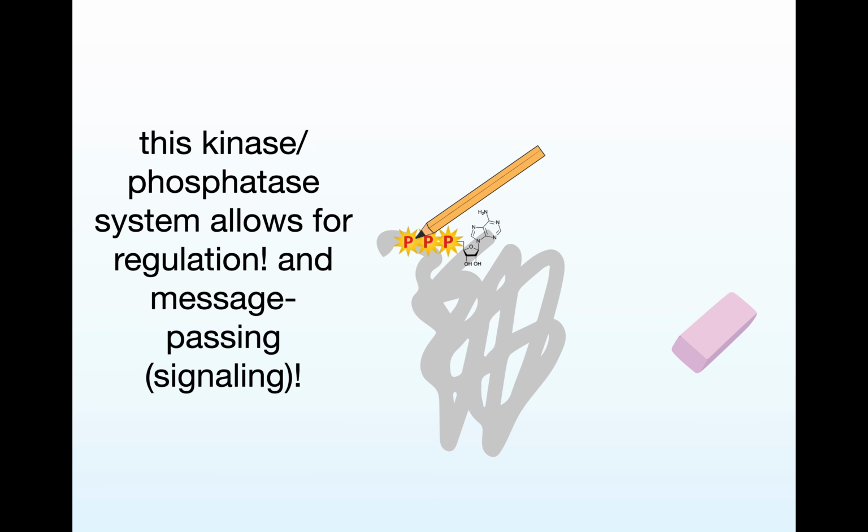So there's also a lot of activity in trying to study selective kinase inhibitors, so drugs that can prevent these kinases from working. So there are a lot of reasons to study kinases and their activity, and whether inhibitors actually do inhibit their activity, so do prevent the kinase from phosphorylating stuff. So we need ways to measure this activity. One of the ways is with a radiometric filter binding paper kinase assay. I'm not sure what the technical term for it is, but I'll show you what I mean.